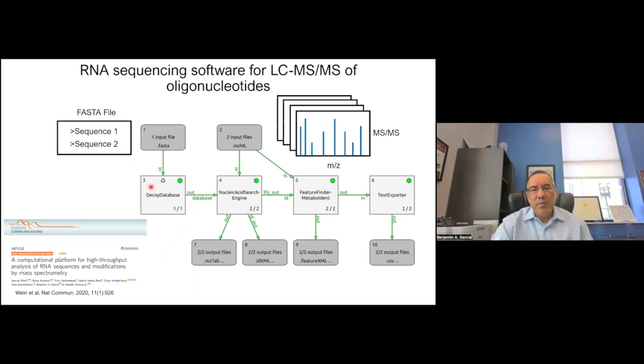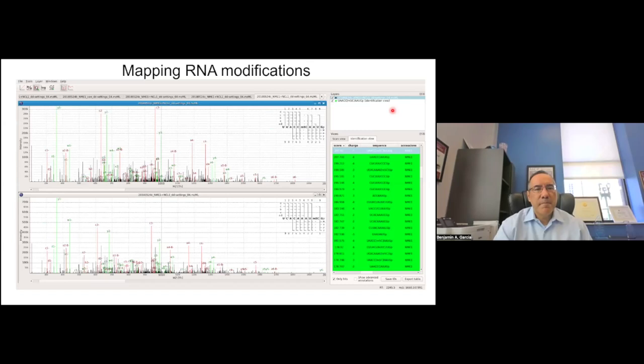And here, we started thinking a little bit more about how proteins have different corresponding isotopes than RNA, and different fragmentation patterns as well, and started putting these into the search engine to be able to do some RNA shotgun omics analysis, mass spectrometry analysis.